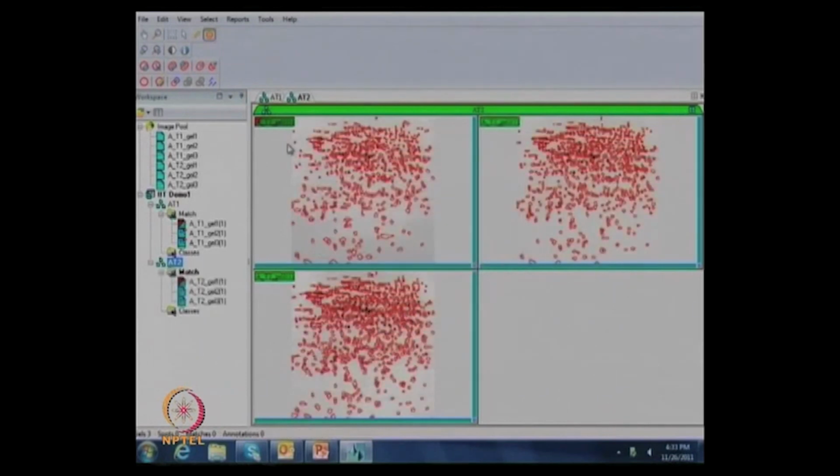That's important because you don't want to make any changes between your controls and treatments. There's no need to remember the parameters either. When you detect your spots, it automatically gives the same parameters you used earlier. So the same smoothness is 3, saliency 15, and minimal area is 5. No need to change anything. Then click on OK. It is quite quick, and then it's completely finished.